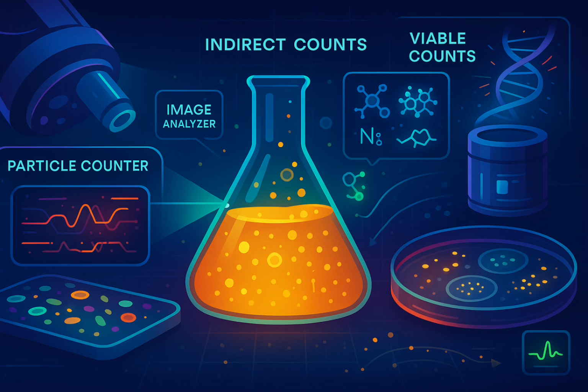Are there automated ways, faster ways to count everything? Absolutely. That's where particle counters come into play, automating the process. Like the Coulter counter. I feel like I've heard of that. Yes, the Coulter counter is a classic. The principle is neat. You suspend your cells in a conductive liquid, salt water, something like that. Usually, yeah. Then you draw this liquid through a tiny hole, an aperture. There are electrodes on either side. As a cell passes through that hole, it disrupts the electrical current slightly because the cell isn't as conductive as the liquid. Creates a blip. Exactly. A tiny voltage pulse.